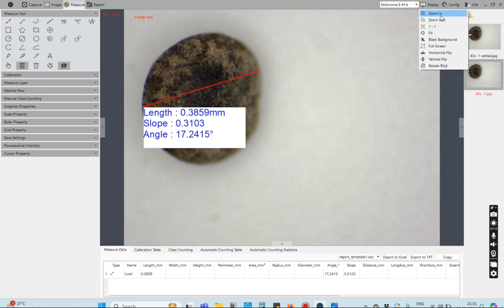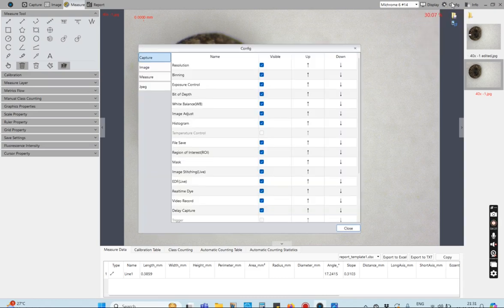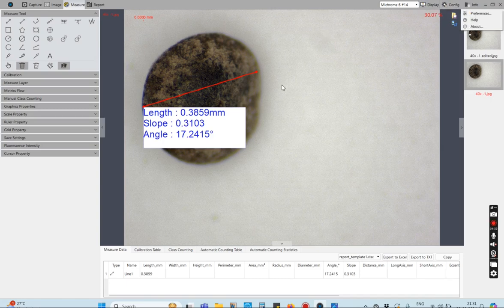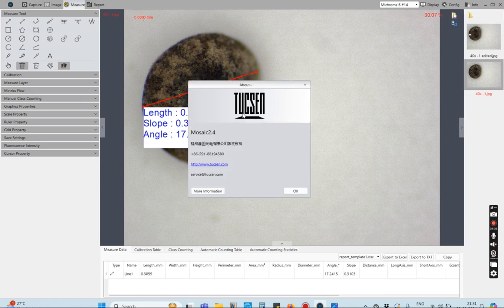Under Display, you have options such as Zoom In, Zoom Out, and Full Screen. You can also flip the image horizontally or vertically. Configuration covers all the options visible here. This shows the particular camera currently in use — I'm using my webcam, which uses the Mosaic software — and Info shows basic software information.